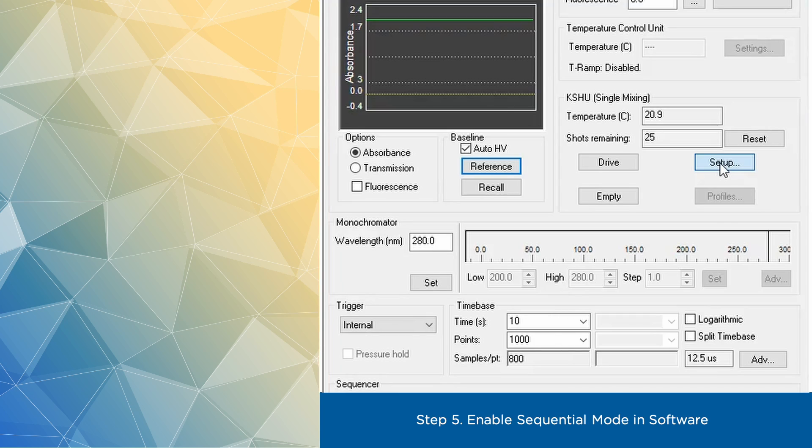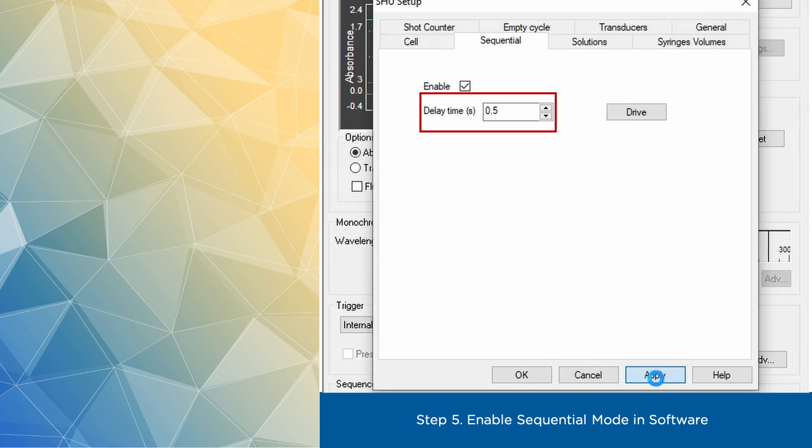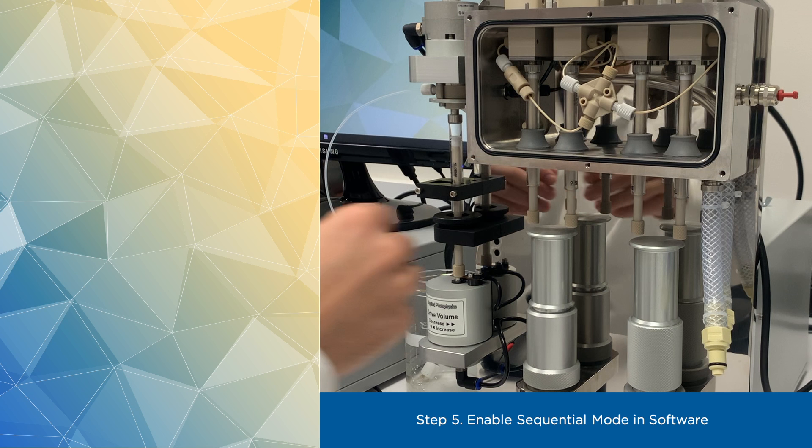Finally, go to ProData SX software, click on setup, switch to sequential tab and click enable checkbox. Here you can also adjust premix time delay, which we will have unchanged for this demo. The software may report this time in either seconds or milliseconds, depending on the version you're using, so be sure to know which one it is.